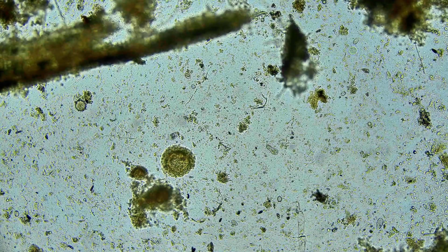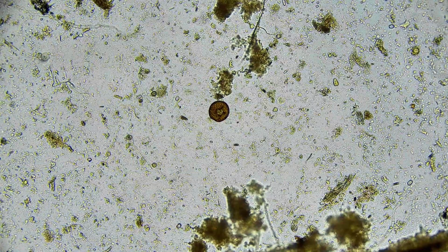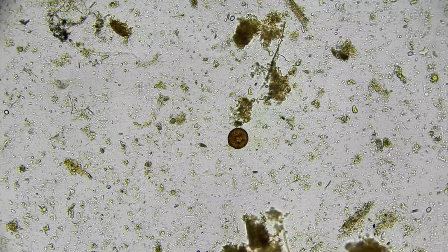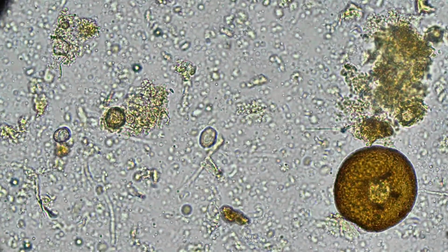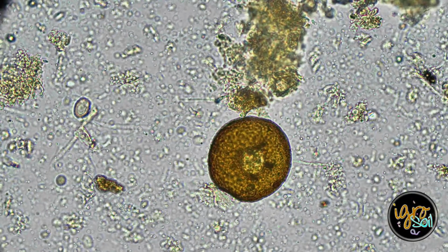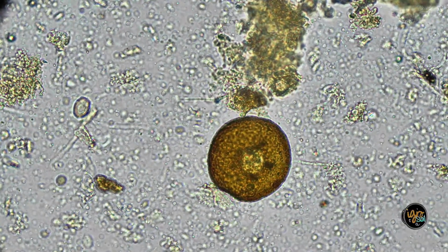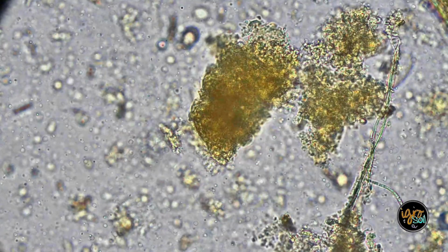And this is just a mushroom block. That has to be that Arcella. Look how big. I'm at 100 magnification. This may be the same Arcella we were looking at, but it's worth jumping back in and looking at that thing again, because actually, this is a different one. So the size of this amoeba, again, an Arcella, is impressive. And that is a testimony to the maturity of this compost. It's been sitting for such a long time that you end up with these types of systems.